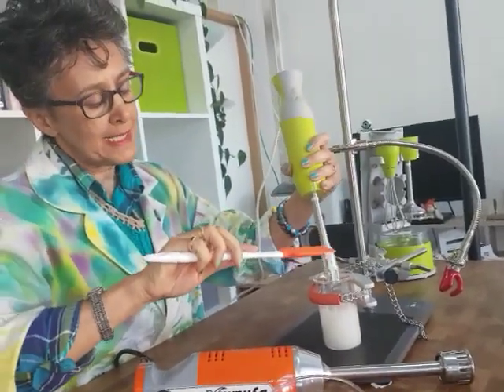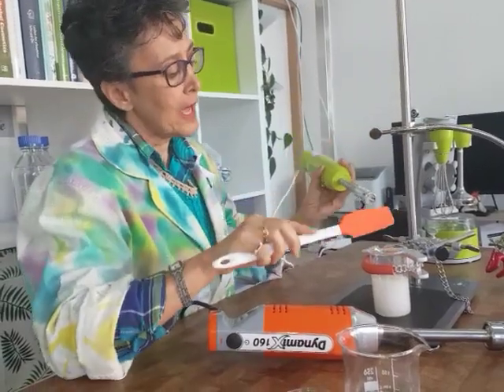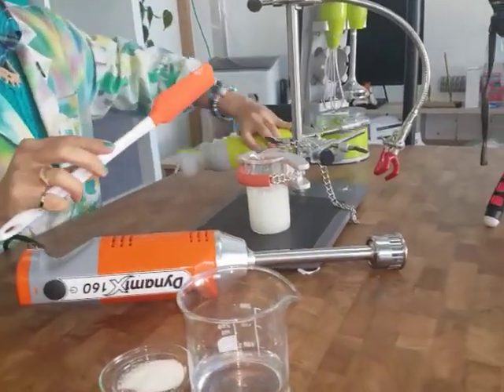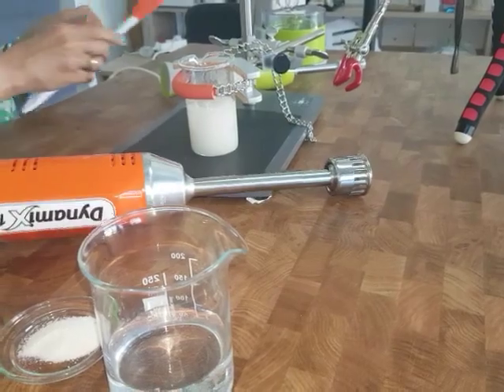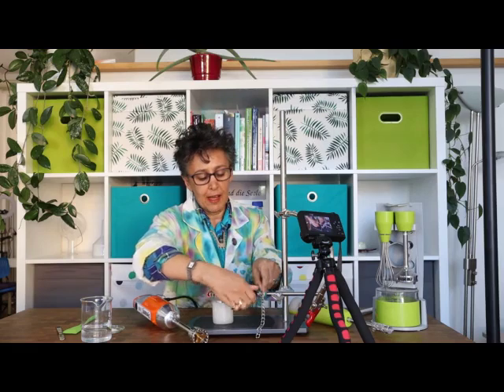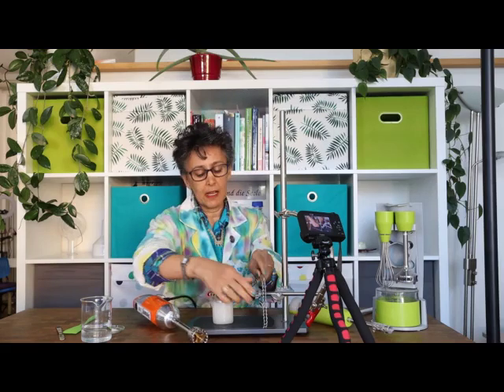This is a 2% dispersion of solar gum AX in cold water. A little bit of gum is clumped here in the cavity, but the rest it did a pretty decent job for a kitchen mixer. Let me put it aside and repeat the experiment with Dynamix.